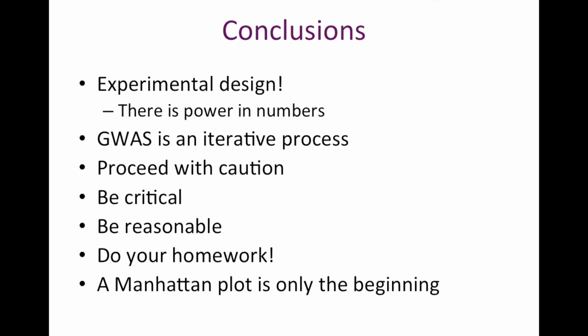And finally, a Manhattan plot is only the beginning. Even if you have a Manhattan plot, you have to do downstream analysis and really keep an open mind and be ready to explore the exciting world of the association of genotype and phenotype.